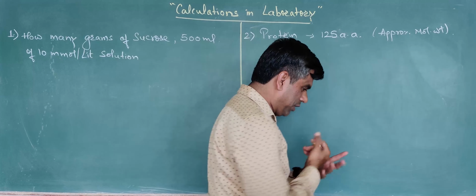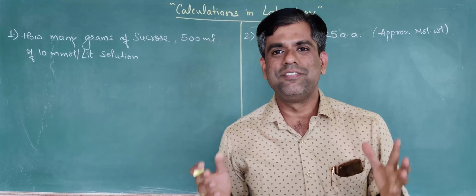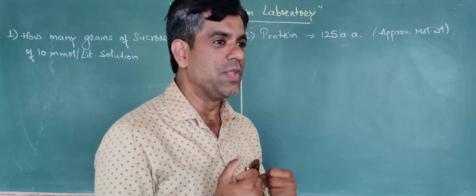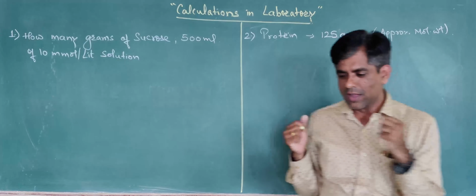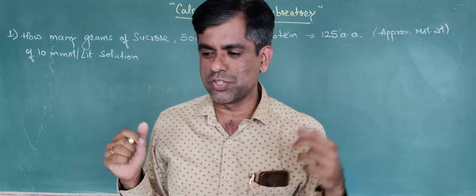So we are back in the laboratory. This is my laboratory actually. Whenever we are doing any practicals in the laboratory, we are very excited to learn new things and explore the microbial world. But many times we have to prepare different solutions, and we are a bit confused about what we'll do and how we'll prepare these solutions.